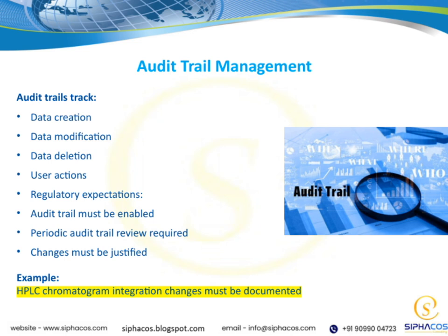From a regulatory perspective, there are some important expectations. First, the audit trail must be enabled at all times. This isn't optional, it's a requirement. Second, periodic reviews of these audit logs are necessary to ensure everything is in order and to catch any irregularities early. And finally, any changes documented in the audit trail must be justified, meaning we need to provide a reason for why modifications were made.